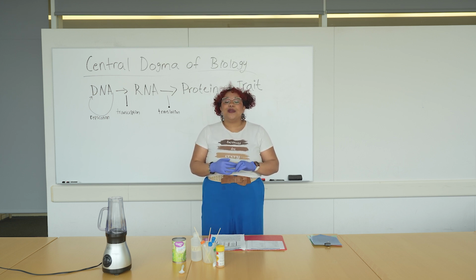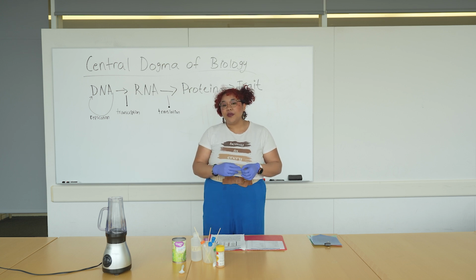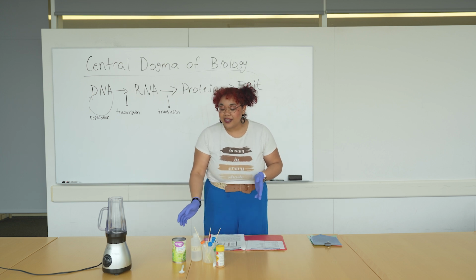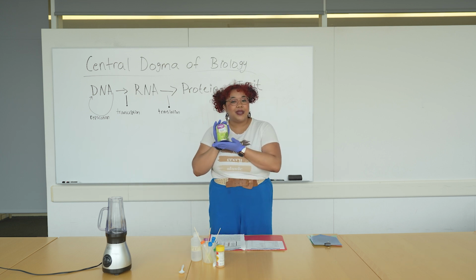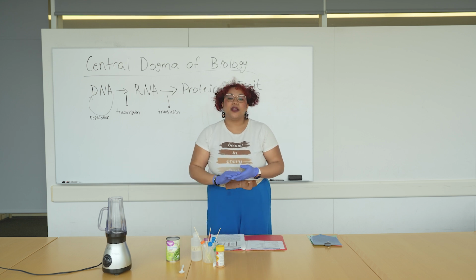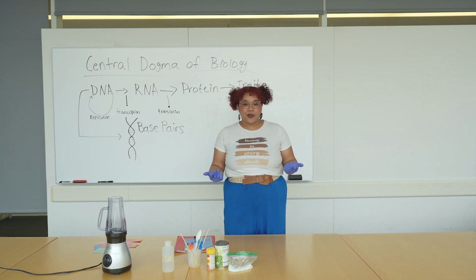And we'll be doing various experiments that will be interactive with the students so they can actually extract DNA from different types of living organisms. But today we'll be using, for our first activity, peas or any other kind of living material that you have access to. So after we've extracted our DNA, the students will then go into 3 subsequent activities.